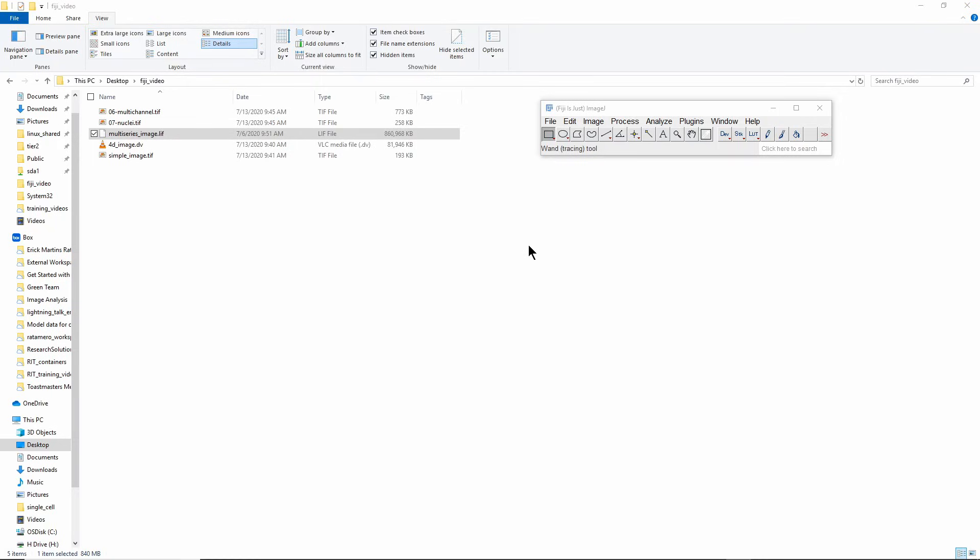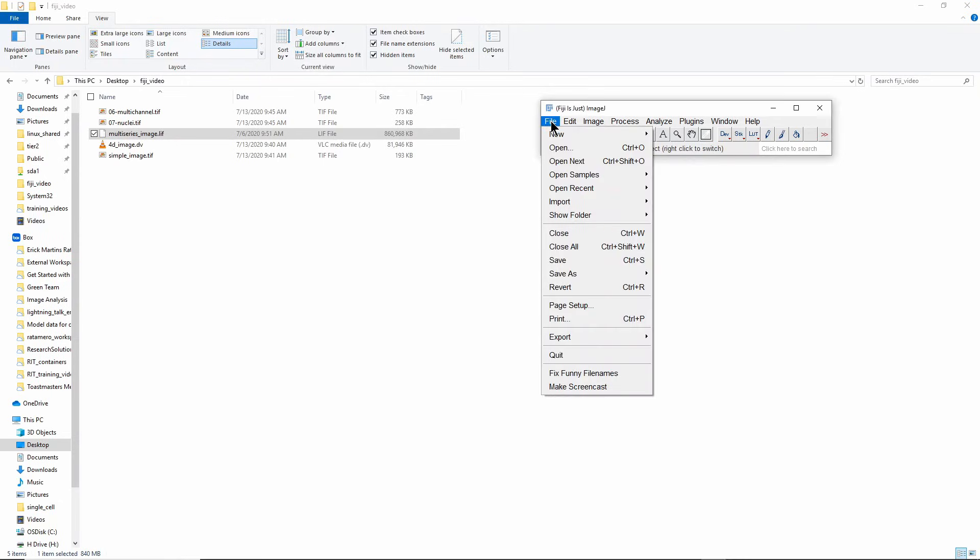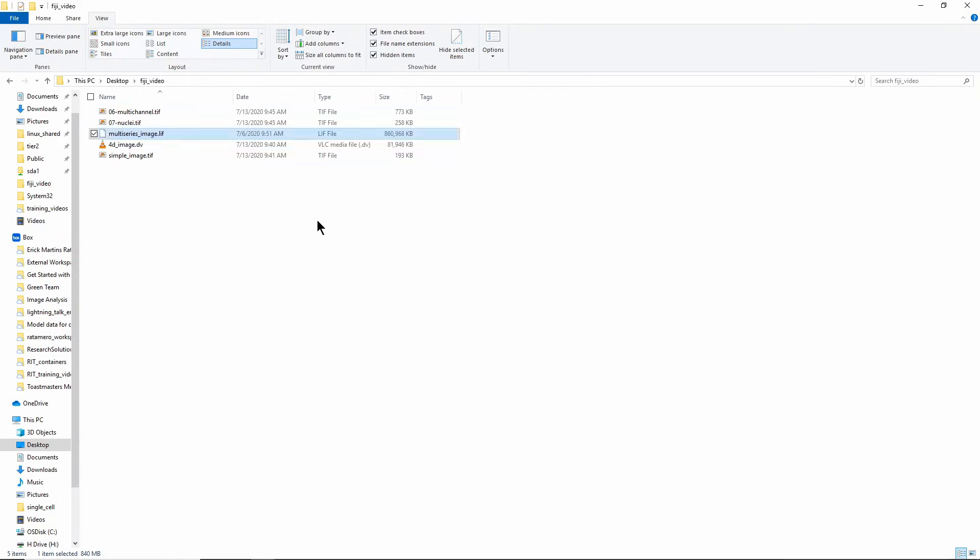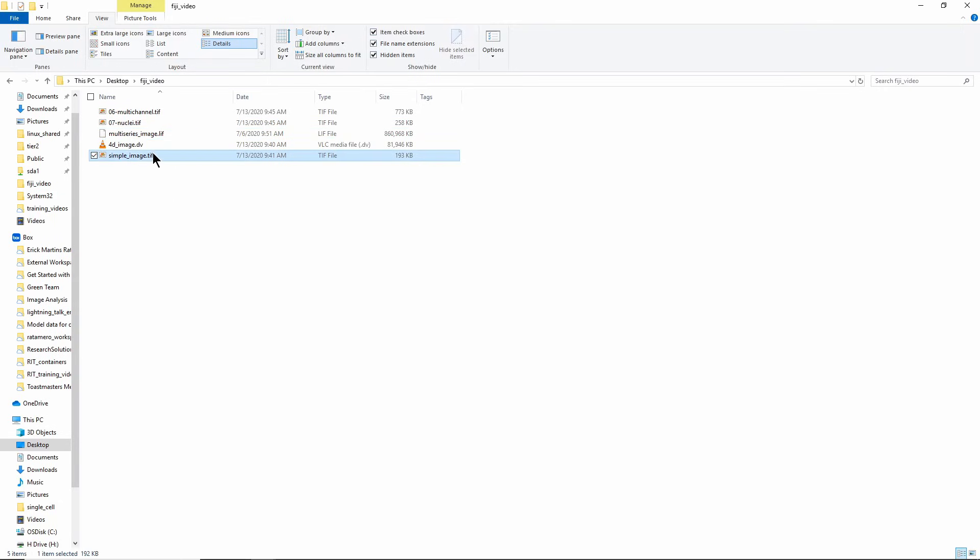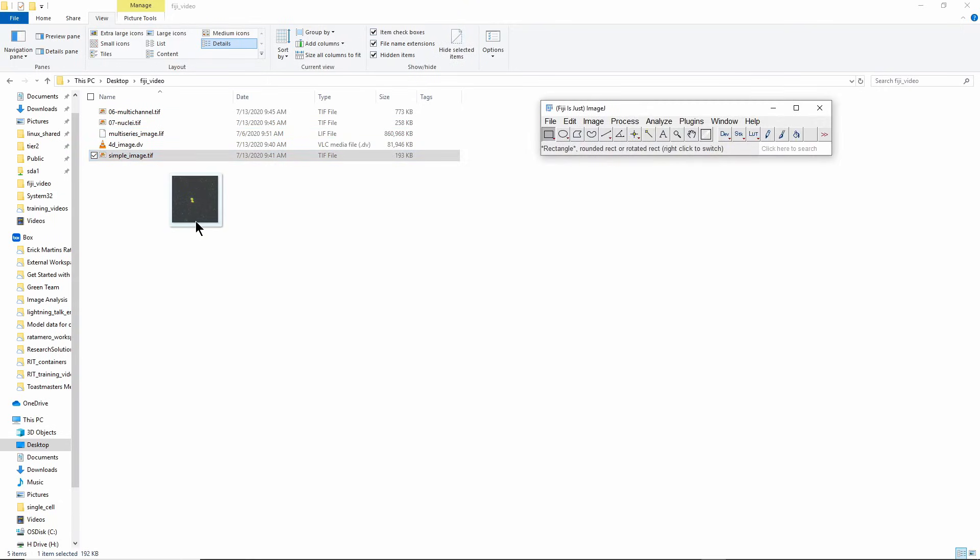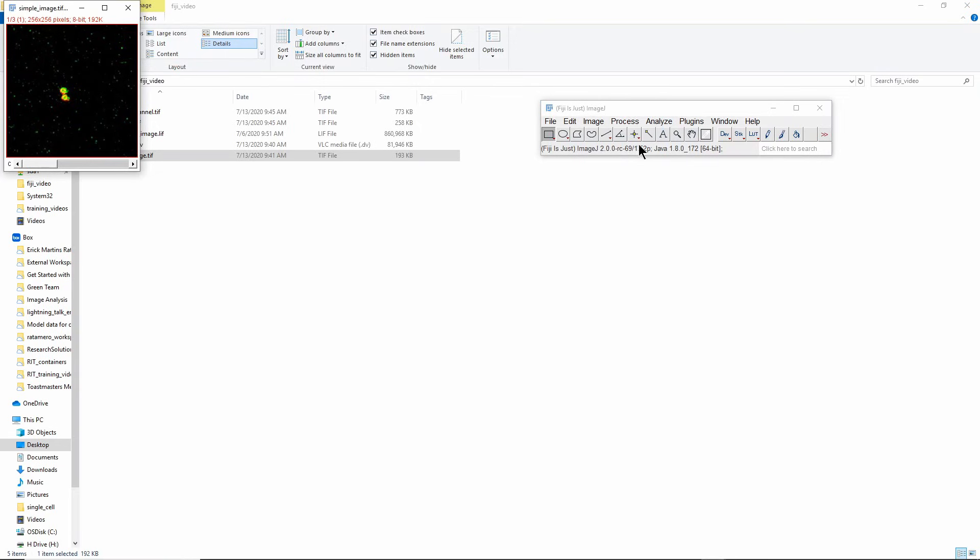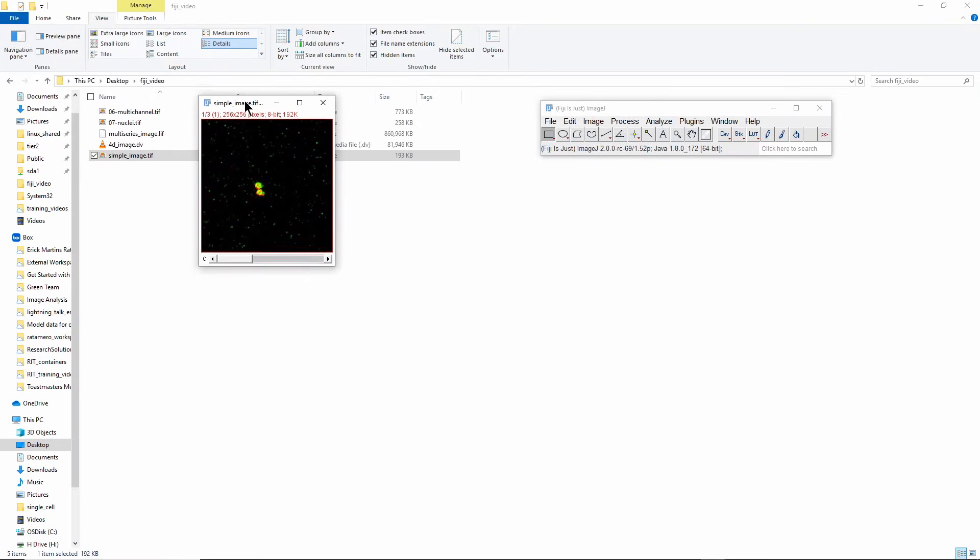I'll start by showing you how to open an image. There are multiple ways you can do that in Fiji. One of them is to go to File > Open, but even easier is to just drag an image. I'll grab that image, drag it into the window, and that's an image open.